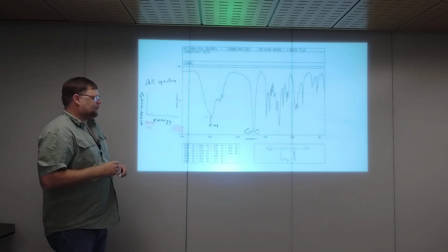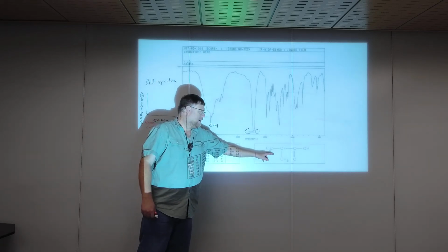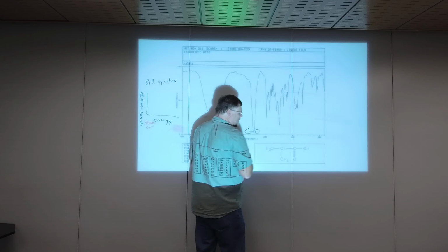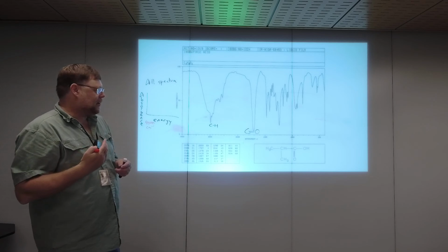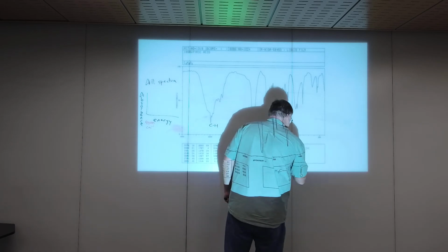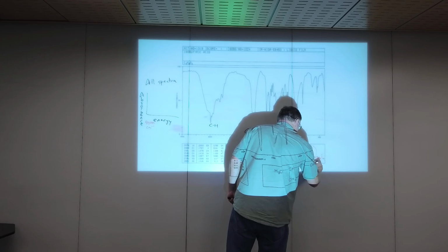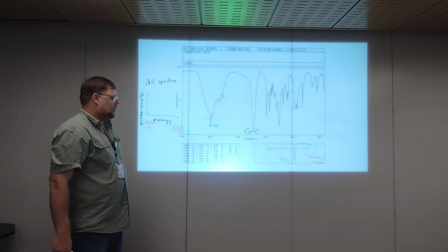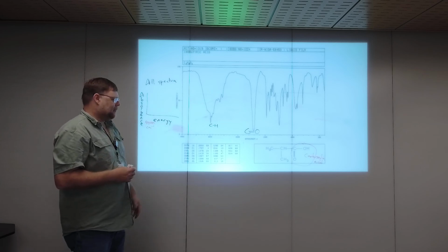And then ask yourself, is this an alcohol? It is not an alcohol. An alcohol has an OH, but that OH can't be bonded to a carbonyl, and there are reasons for resonance. For one, the electron withdrawing nature of a carbonyl. When a carbonyl is bonded to an OH, this is a carboxylic acid. It's a functional group you definitely need to know. It's a really common one. That H is quite acidic, based on what you'd expect from the name.